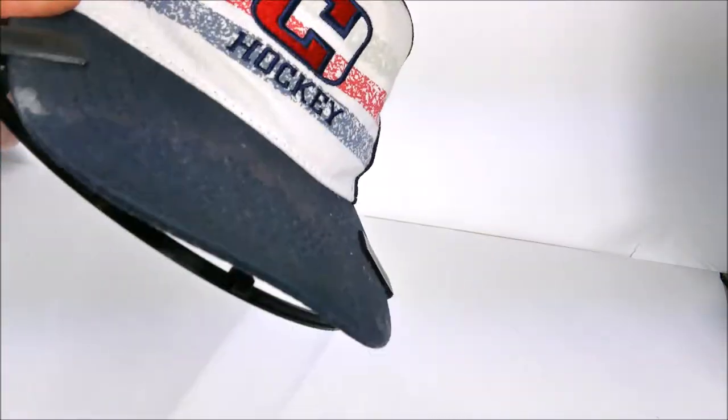Let me just put that on and we can see what it looks like. Here's what the mask looks like when it's being worn. Just a simple donning of the hat and it moves on and off quite easily. I could trim these edges to be any shape I like, but for now it's just a straight cut. It's not interfering with my vision and it prevents my breathing from getting on anybody else while preventing their spatter from getting on me.